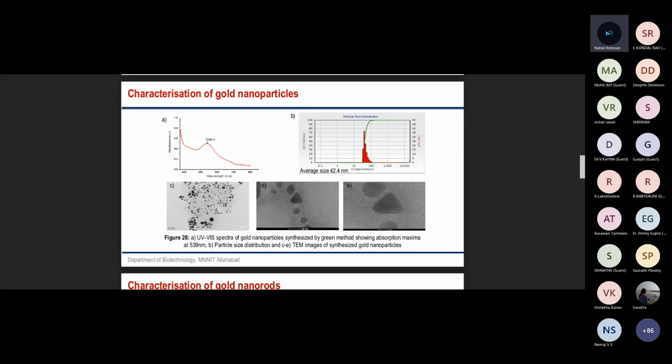And then at the different nucleation sites, as visible here in the TEM, the transmission electron microscopic picture of these gold nanoparticles, it is growing, and when it is growing you can see various shapes of these nanoparticles. When you see the close up, you will see different lattices and planes of the lattices. So all the lattice characteristics can be obtained when you magnify it further.